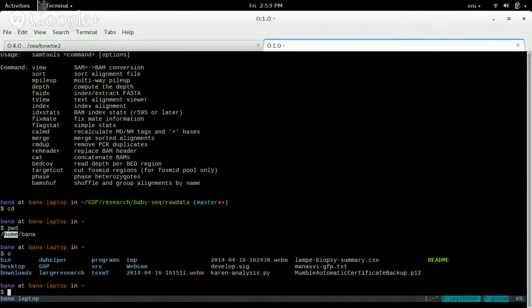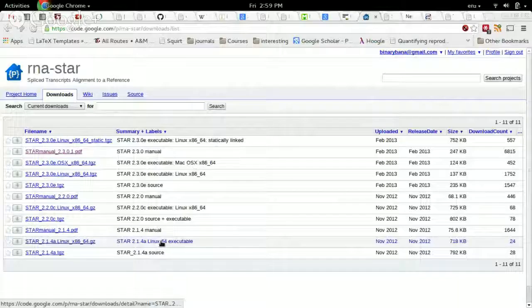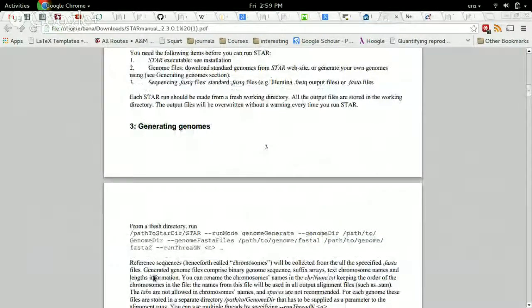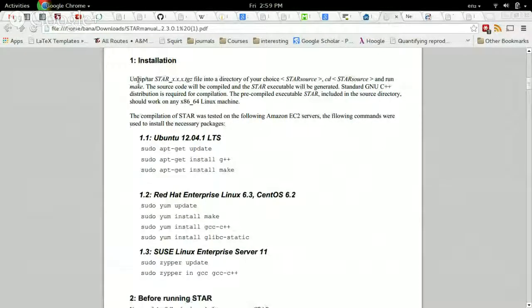And when you go to use a manual, that's what they'll recommend how to install it through. Possibly. Some might say that. It depends on the tool. So, like STAR is a new enough tool and not popular enough that they know that it won't be in the repositories, and so they won't even use the package manager because they know it's not in any of the repositories. So yeah, if you look in the manual for STAR, it'll say basically grab the source code.